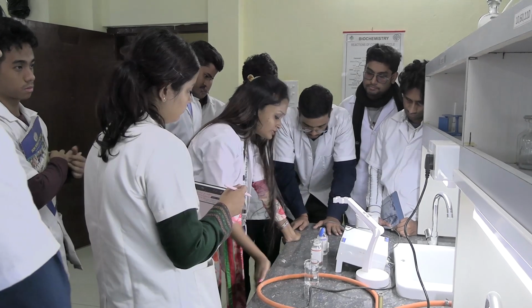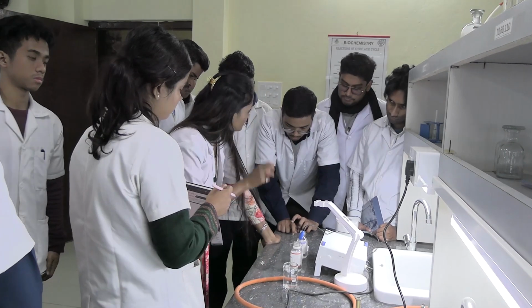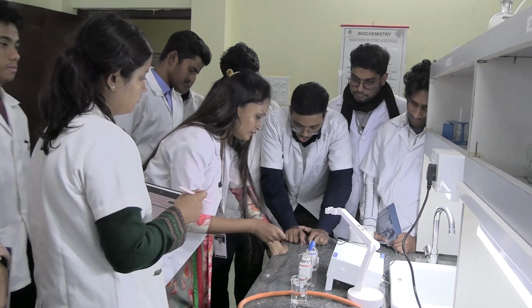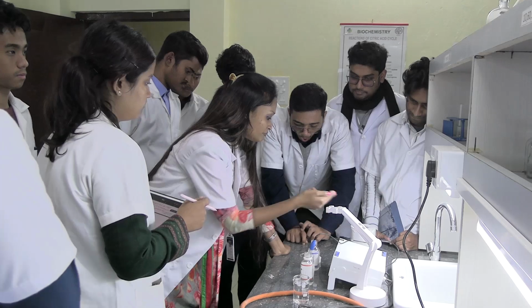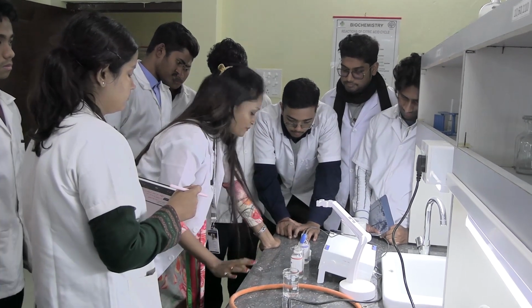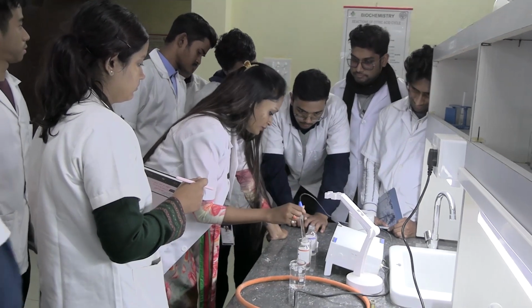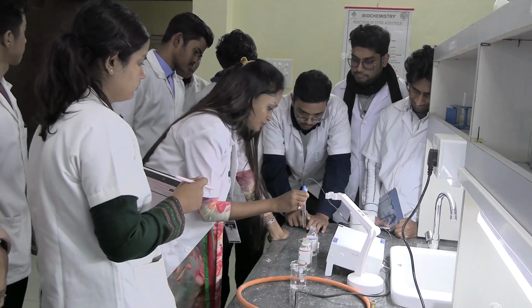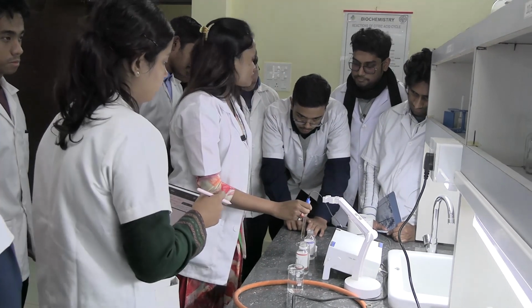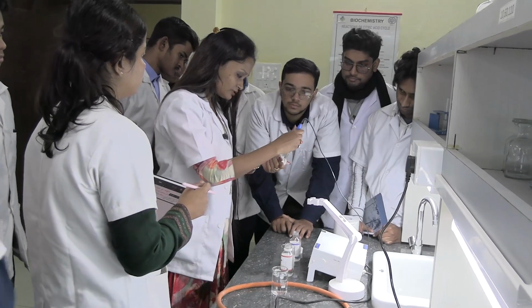Calibration of the pH meter is for any solution like this: we can calculate the pH and calibrate with the pH meter to see whether the result is precise or not. For any solution, if you dip this electrode bulb, it will give the pH of that solution. So what is this electrode bulb?